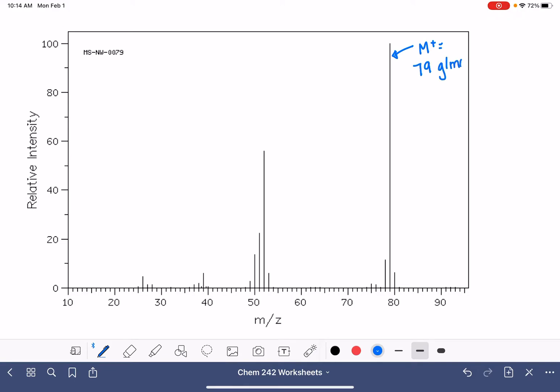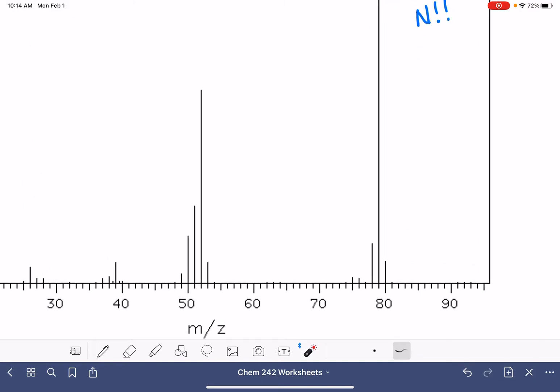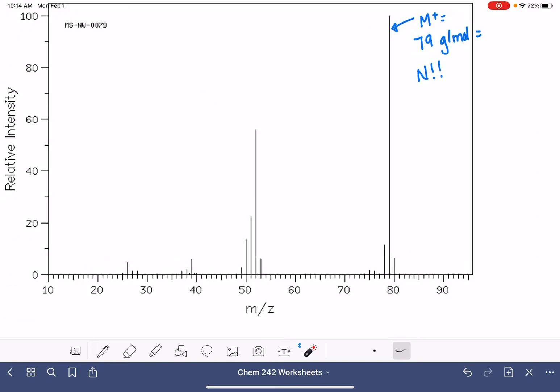Because this is an odd number, that tells us that we have nitrogen in the molecule. We don't have, or I guess maybe we kind of have an M plus two peak right there at 81, but not enough for us to pay attention to. So no chlorine, no bromine.